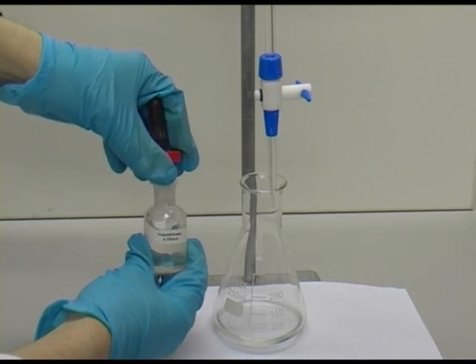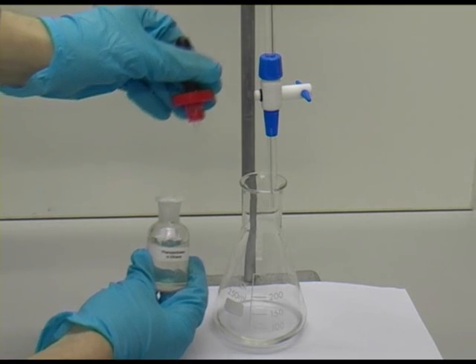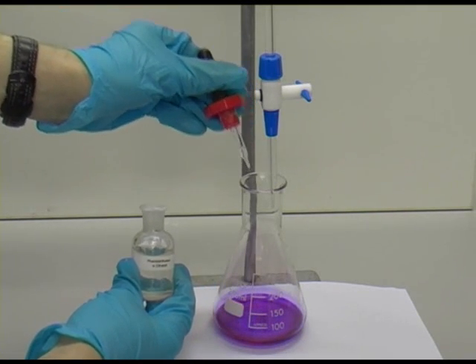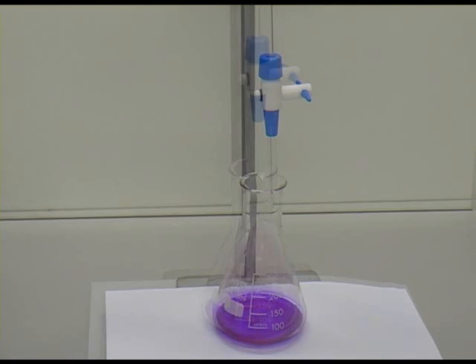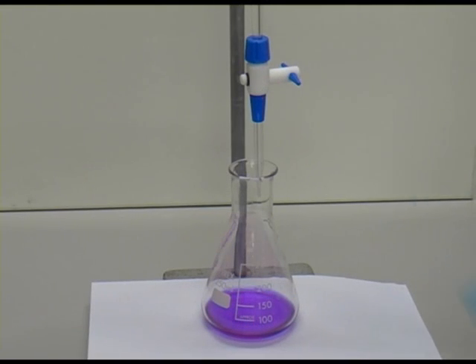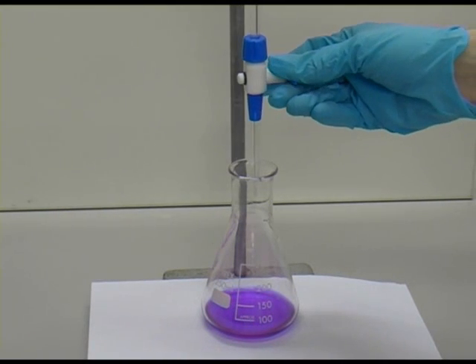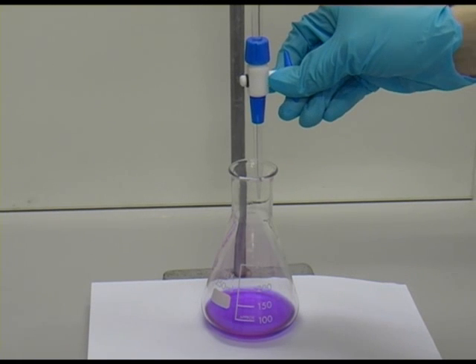Here we are going to use a slightly different indicator, phenolphthalein. It's coloured in an alkali but clear in an acid. We begin to add acid to the alkali using this piece of equipment, a burette.